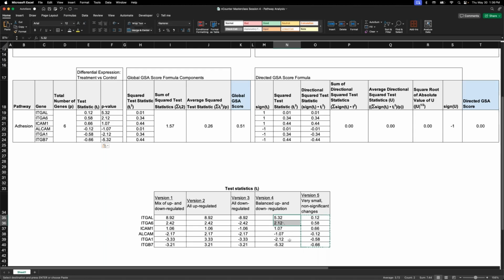The scenario I showed you before is this one here, where you have genes that, in terms of their magnitude of change, up versus down regulation, is significant. Some are pretty strongly upregulated, some are pretty strongly downregulated. Our global score is decent, indicating there's some change happening in this pathway, but again, the directed score is 0. So just keep this in mind when you see values that are close to 0. It can indicate very little change in the pathway, or it could indicate there's a lot of upregulation that's also offset by a lot of downregulation.